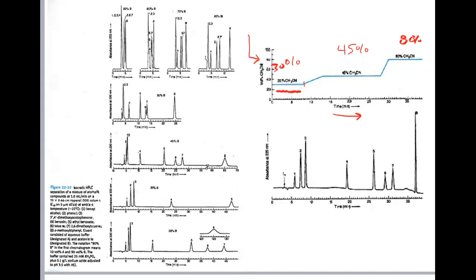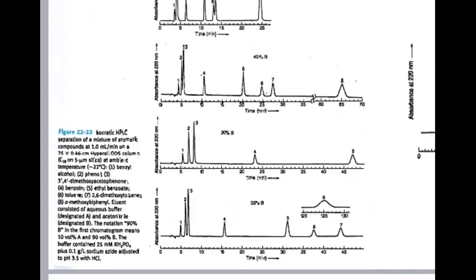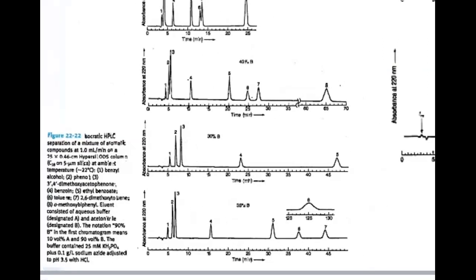So in this particular run, if I'm just going to zoom in a little bit so we can see it, there's a lot going on here, okay? But there's an isocratic separation of a mixture of aromatic compounds, 1 milliliter a minute on an ODS column, octadecylsilane, so that tells me it's a C18 phase, 5 micron silica, I'm just reading down here at the bottom, that tells us the particle size, at ambient temperature, okay, room temperature. And they label the peaks, benzyl alcohol, phenol, a bunch of different compounds, right? I'll list right there. The eluent consisted of aqueous buffer and acetonitrile.